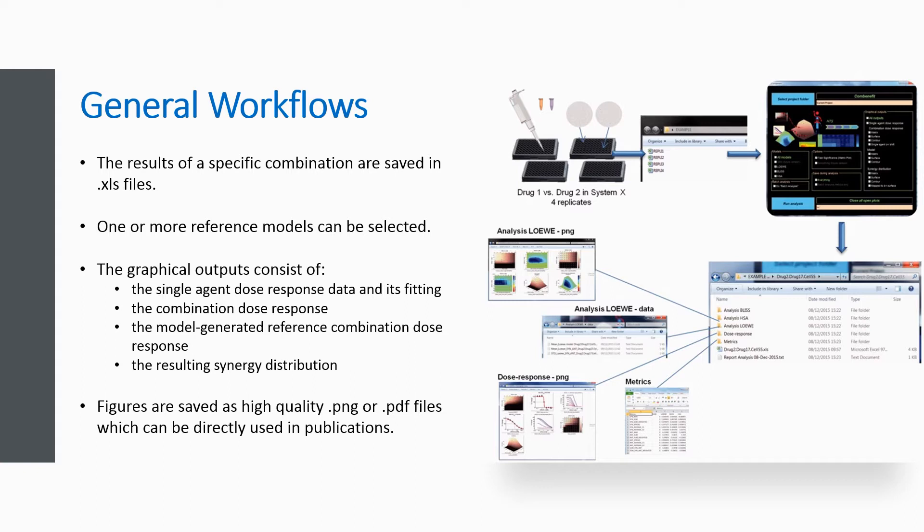Additionally, a graphic mapping the synergy distribution onto the dose-response surface can also be displayed to facilitate interpretation. All figures, as well as corresponding data, fitting parameters and synergy metrics can be saved in the project folder. Figures are saved as high-quality .png or .pdf files which can be directly used in publications.